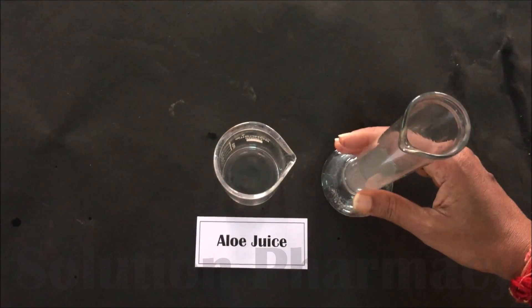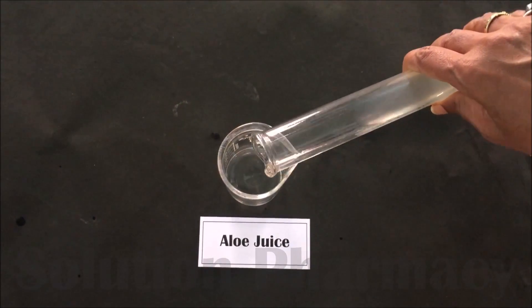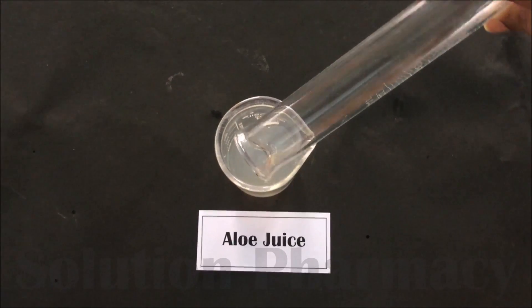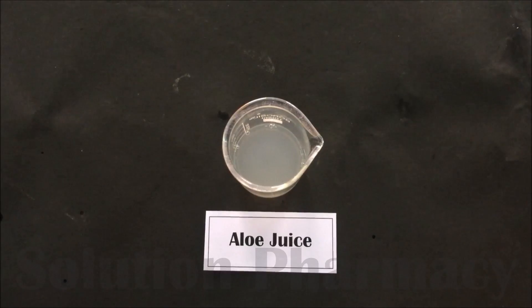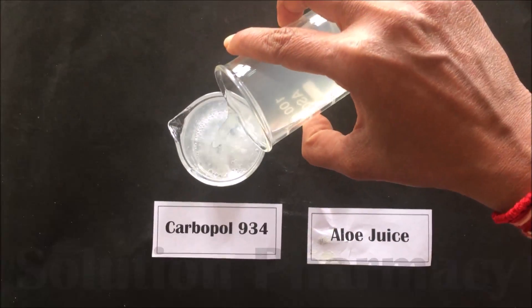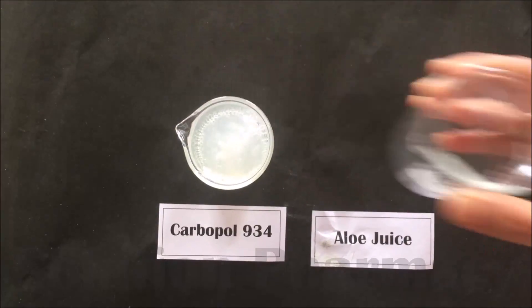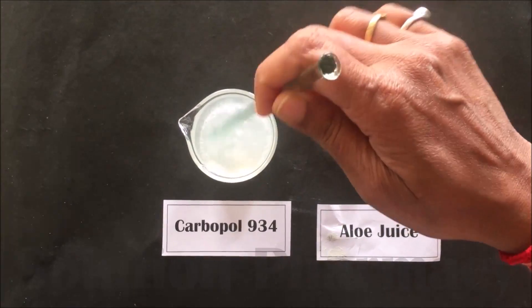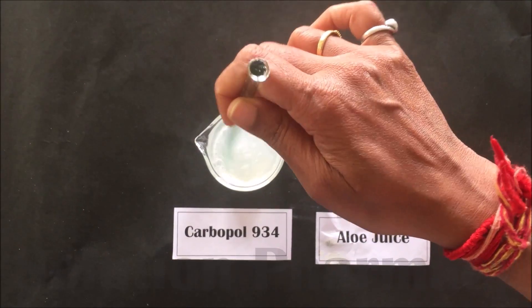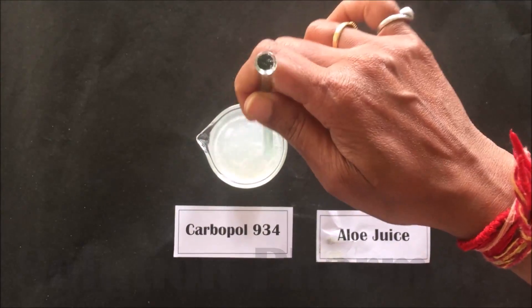Then measure 35 ml of the aloe juice we have already prepared, measure it into a measuring cylinder, and transfer it into a clean and dry empty beaker. After this, transfer the already-measured 35 ml of aloe juice into the Carbopol dispersion prepared in the methylparaben, and then mix it properly with the help of a glass rod.